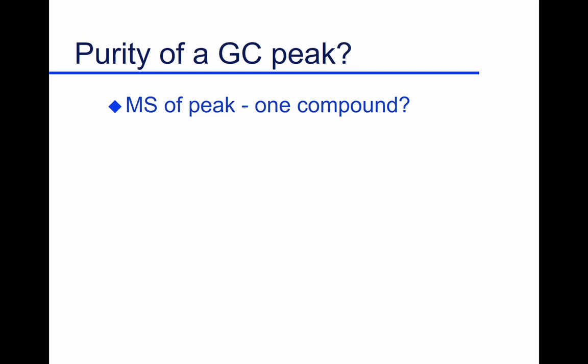One of the things we've monitored for in the past was benzene in food. There's a 10 part per billion standard for benzene in food. And so if you do your normal gas chromatography and you get a peak where benzene elutes, and it's close to 10 parts per billion in that ballpark, do you know what it is? Do you know it's only benzene? It's important to know that. You could be legal, illegal, you could face a product recall if it's over the limit.